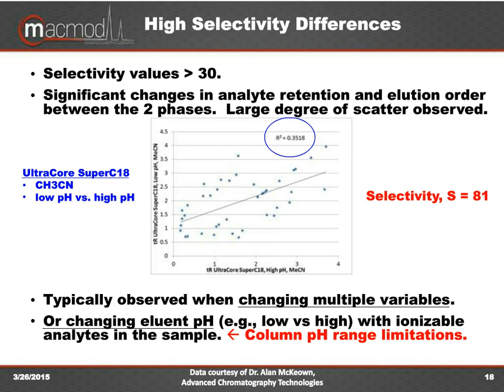Again, when you are changing pH, you want to do that with a column that can handle the other conditions. Obviously, you don't want to carry out method development on a column that's going to last you for a few days or a week.